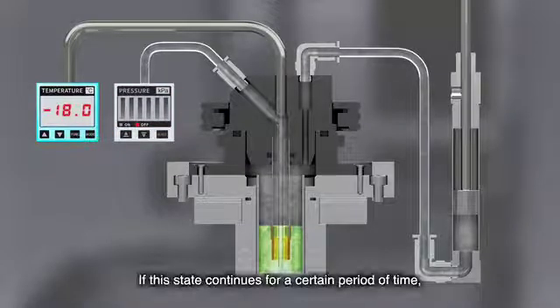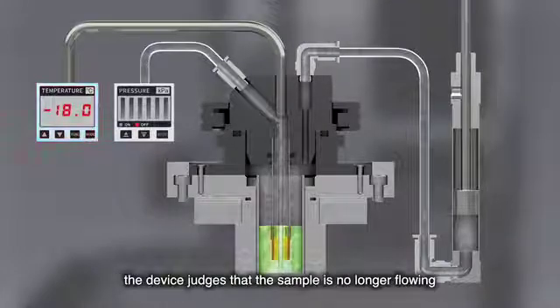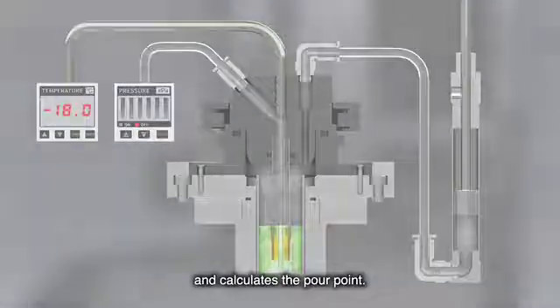If the state continues for a certain period of time, the device judges that the sample is no longer flowing and calculates the pour point.